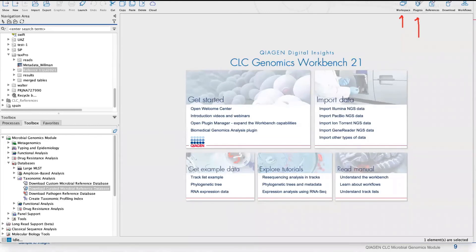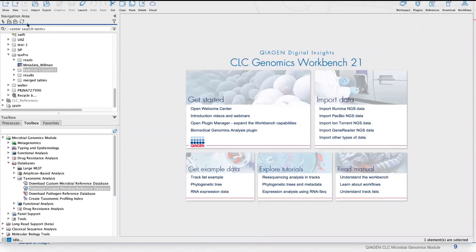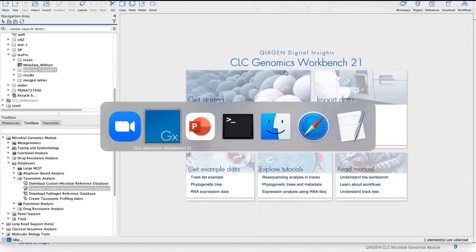Plugins — this is where we can go in, install, and manage plugins. We have a reference manager for downloading genomes and other model organisms, a download function for downloading sequences from NCBI or SRA data, and the ability to manage or build workflows. So the key areas are: navigation area in the upper left for storing data, the toolbox for executing tools, the working space in the middle, import functions in the upper left, and the plugin and workflow editor in the upper right.